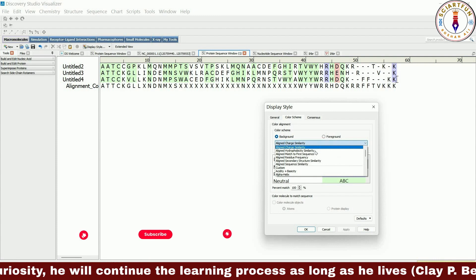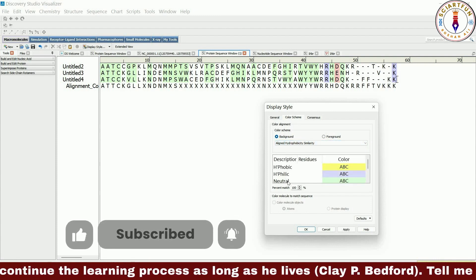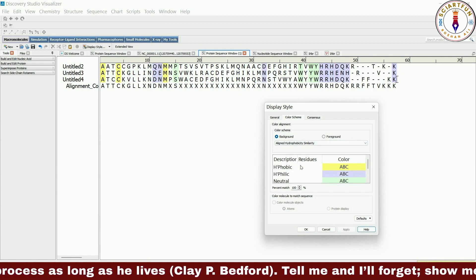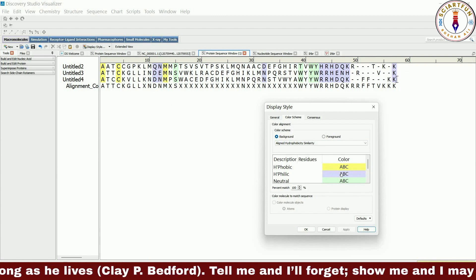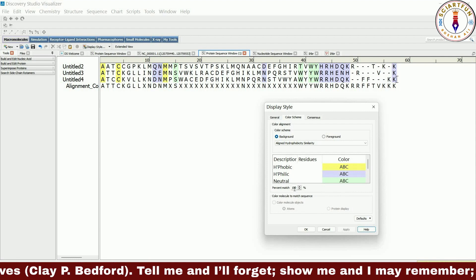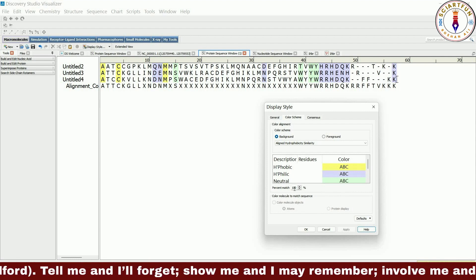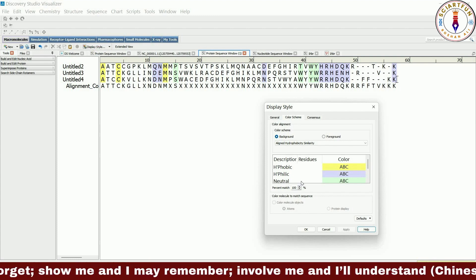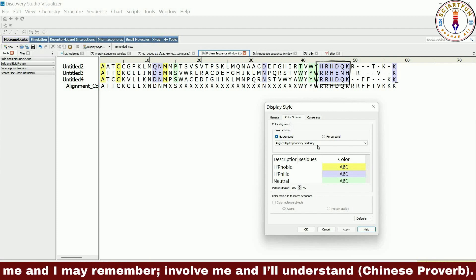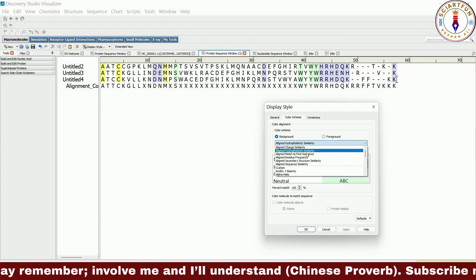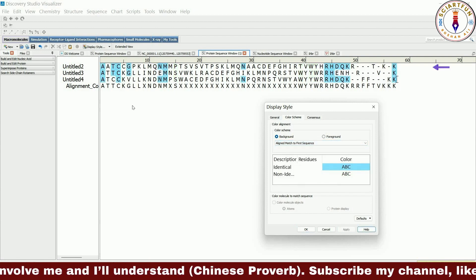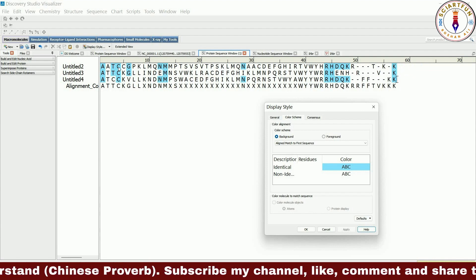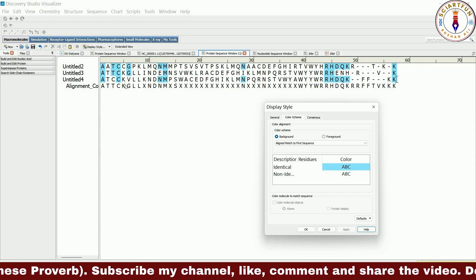If you select the hydrophobicity option, columns where all residues have hydrophobic properties will be colored yellow. Blue colored columns mean all residues in that column are hydrophilic, while green means neutral. Colorless means there is no match among the residues in that column. For example, this yellow column means all of them are hydrophobic residues, and these columns with blue are all hydrophilic.